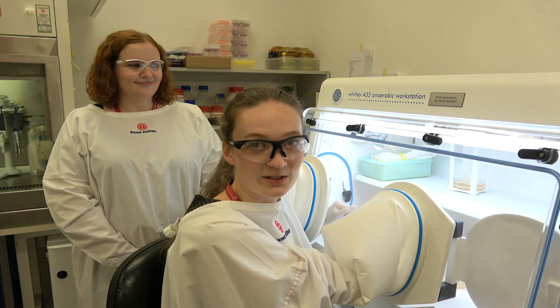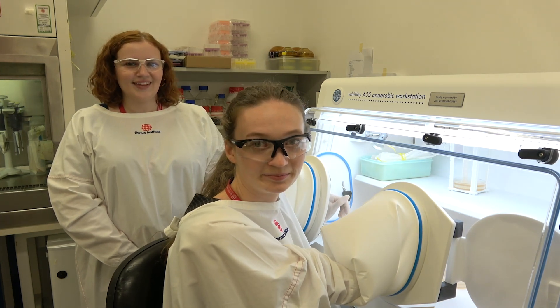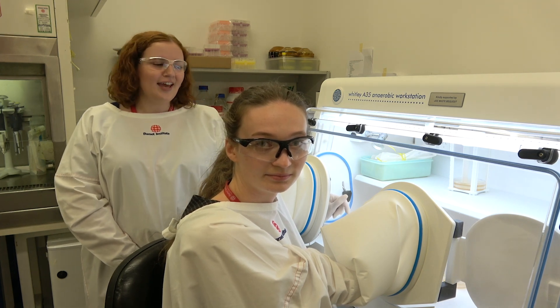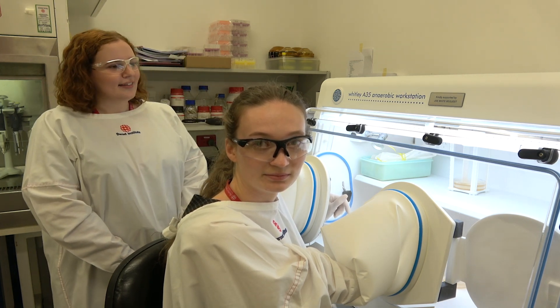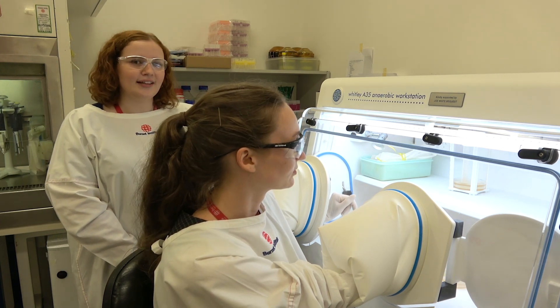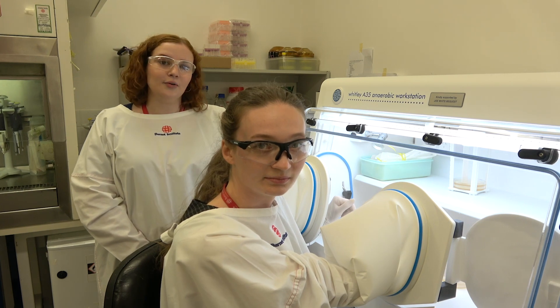Hi, I'm Jenna and I'm a research assistant in Lindy Meissen's lab. And I'm Bree, I'm a PhD candidate with Gilda Tashgen. Today we're demonstrating the anaerobic workstation, which is a special piece of equipment that allows us to grow bacteria in a low oxygen environment.